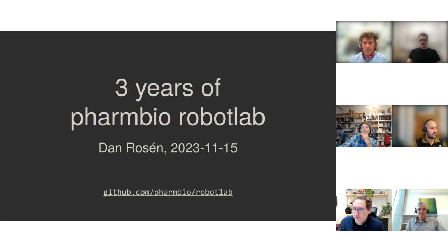So we have a wet lab automation project at Uppsala University in the pharmbio group, led by Jordi, Carreras, Poiver, and Ola Spjut. And the software we write for this is also open, and all of it is on this webpage.